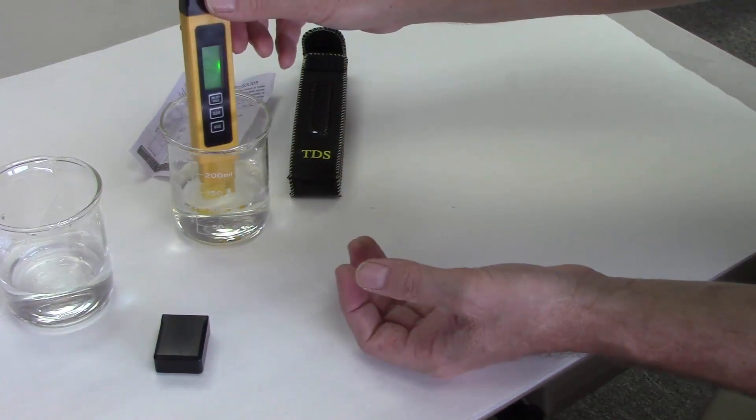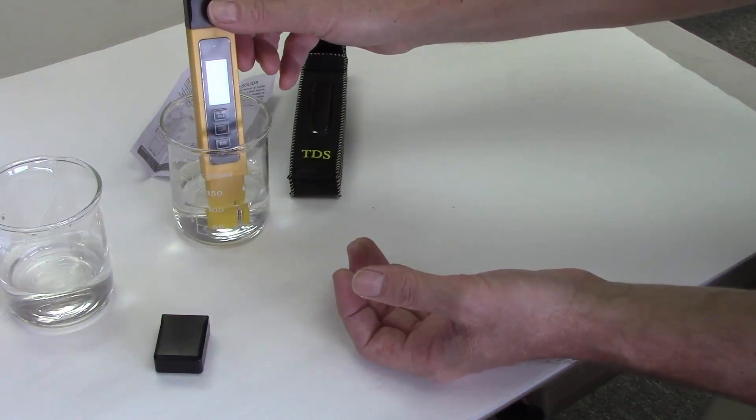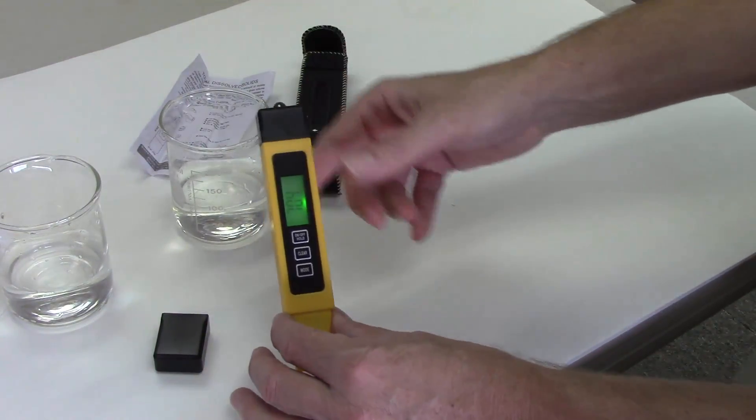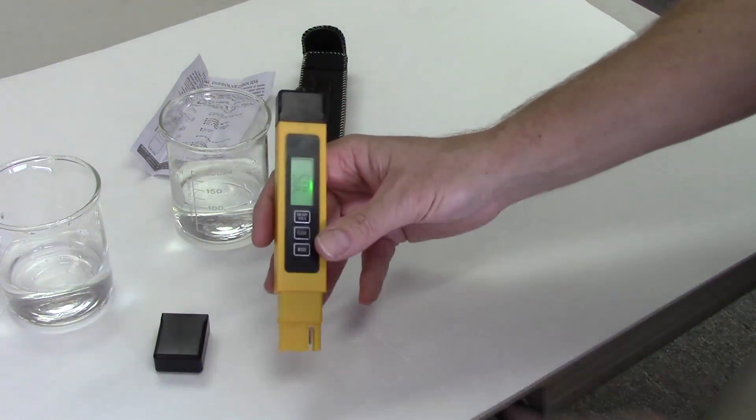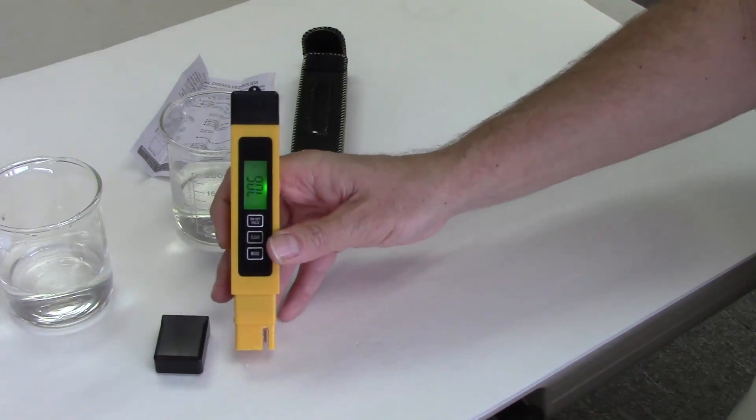So for example, in Fahrenheit right now, the probe is probably out of the meter here, but I'm getting a reading of about 70 degrees, which is what my water is sitting at right now today because I've had it out for a little while. So that's how the TDS meter works, folks. Thanks.